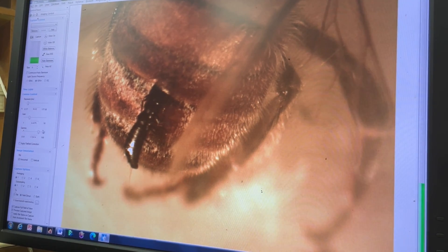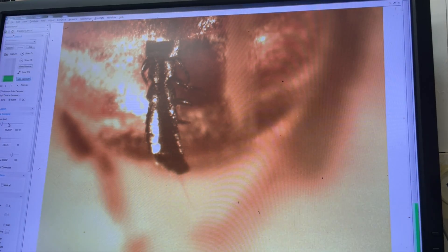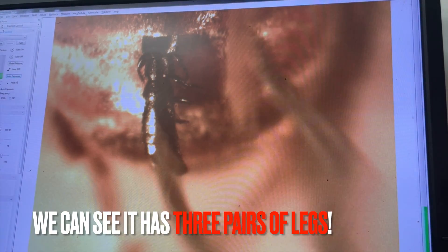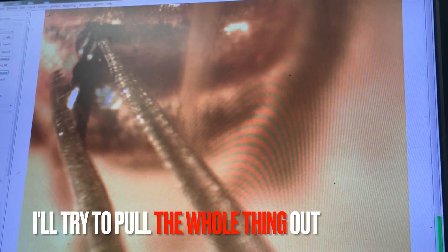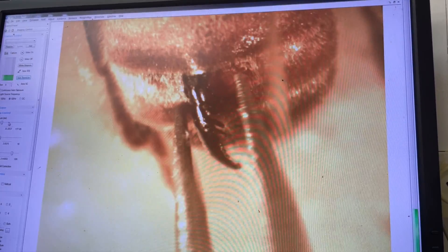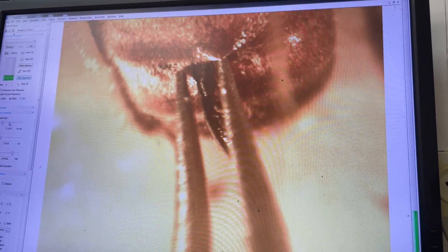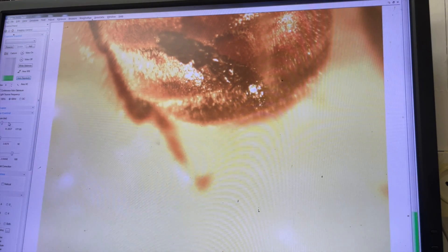So what is it — an insect, or dirt? Looking closely, you can see that this weird thing has three pairs of legs, which is characteristic of insects in general. So I tried to pull the whole thing out carefully — I didn't want to rip it apart because then I won't see what's going on inside. Here I am using forceps in order to pull it out gently. Eventually I managed to pull it out, and now I'm going to put it aside and take a closer look.